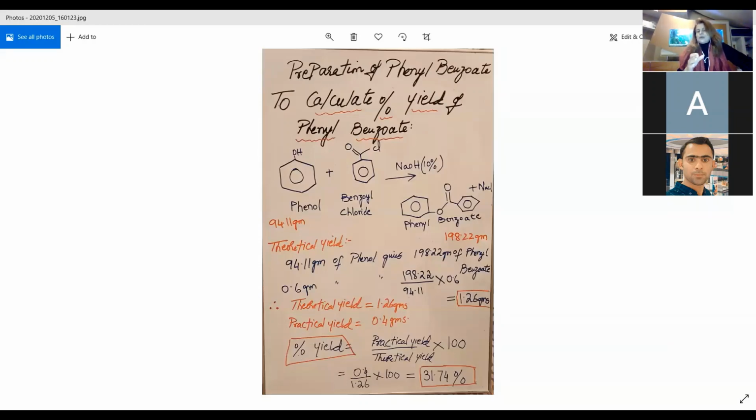So they have recommended ethyl alcohol, because ethyl alcohol is always the best solvent to recrystallize or get back the precipitates, right? Whatever precipitation you need, the nature of this solvent is so friendly that it gets your precipitates back. It has a friendly nature.